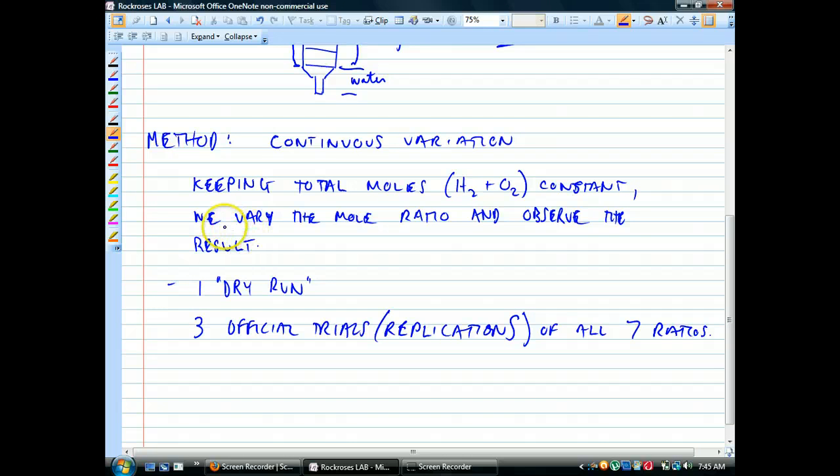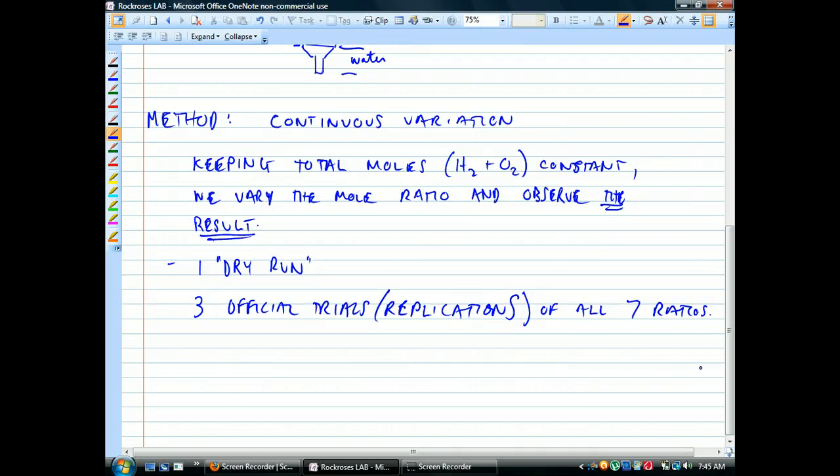All right, now, what do I mean by this? The result. What is it we are going to observe? Well, there's going to be a small explosion. So here's what you do. Now hydrogen and oxygen don't react until they are ignited. So there's some activation energy required here. And to get this to work, as long as I keep this upside down, the gases won't leave. When I turn it up, they could escape.